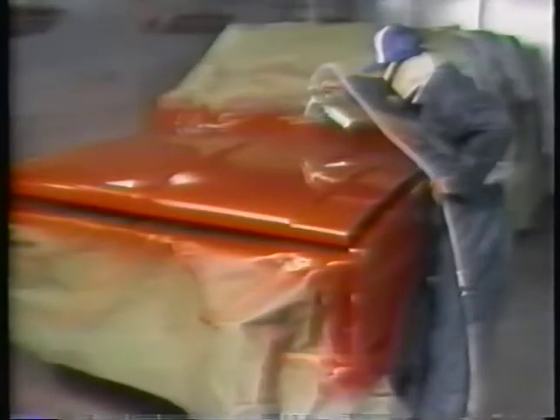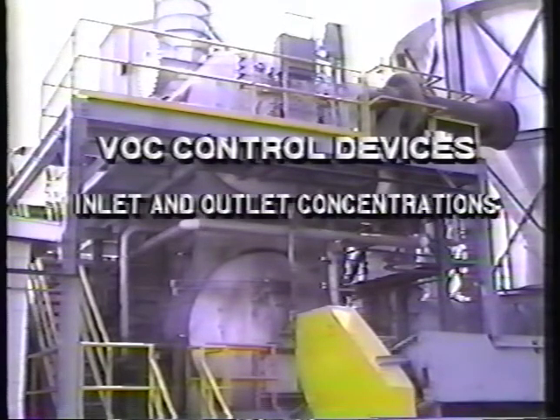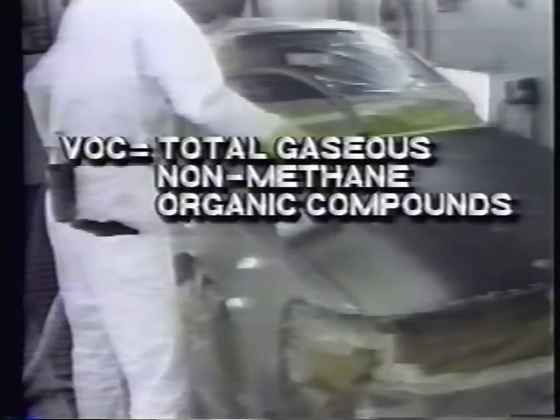In 1977, the EPA wanted to require that VOC control devices at automobile plants operate at a specified efficiency and needed a test method to measure inlet and outlet concentrations of volatile organic compounds, or VOC. For the purposes of this discussion, the term VOC refers to total gaseous non-methane organic compounds. In general, emissions from VOC sources typically consist of mixtures of organic compounds, and there is presently no VOC detection technique producing a consistent quantitative response to all mixtures.